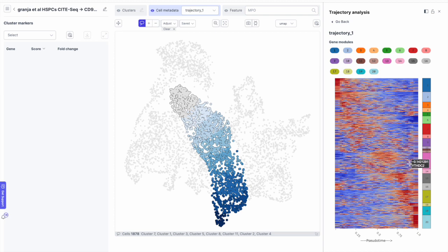in this heat map. So for example, this cluster 1 of genes, they are the ones that are high expressed early in the pseudotime and then go down regulated along the pseudotime. And then we have the opposite, of course, in this gene cluster 20. So you can at any time point highlight the genes of each of these steps.